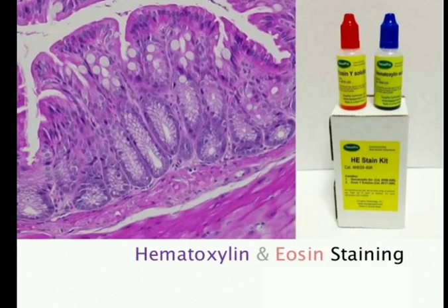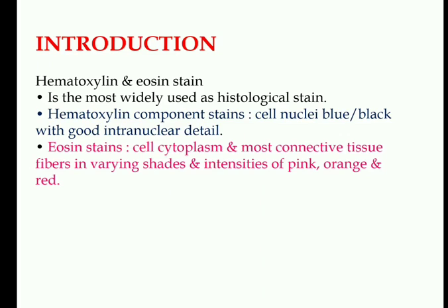In today's video, we will be discussing hematoxylin and eosin stain, which is the most important part of a histopathology lab. Now, let us learn about the introduction. Hematoxylin and eosin stain is the most widely used histological stain.